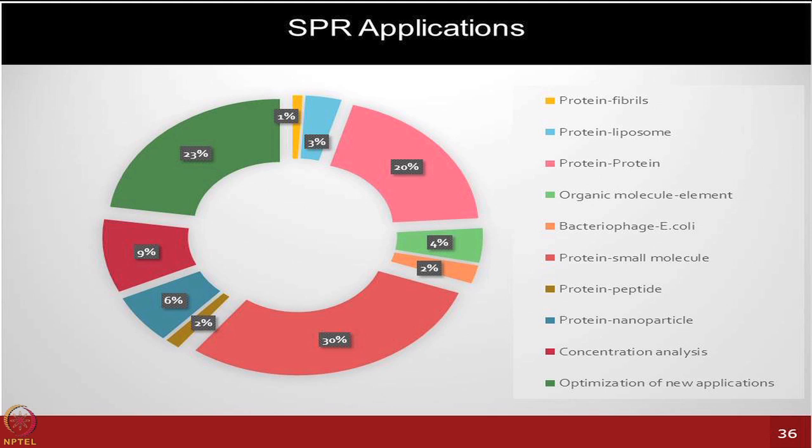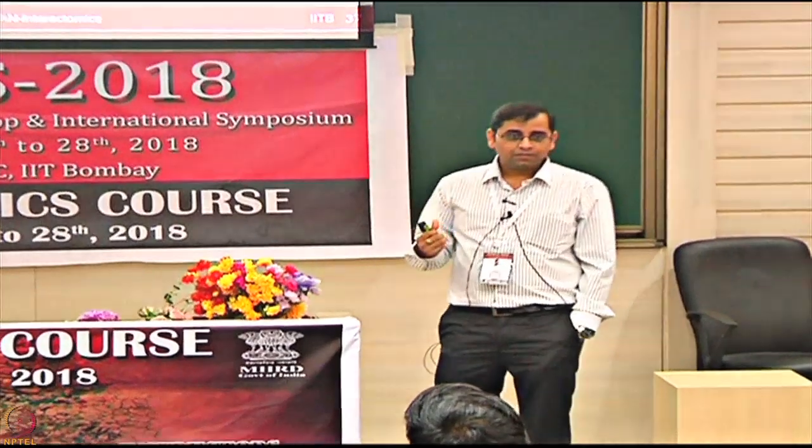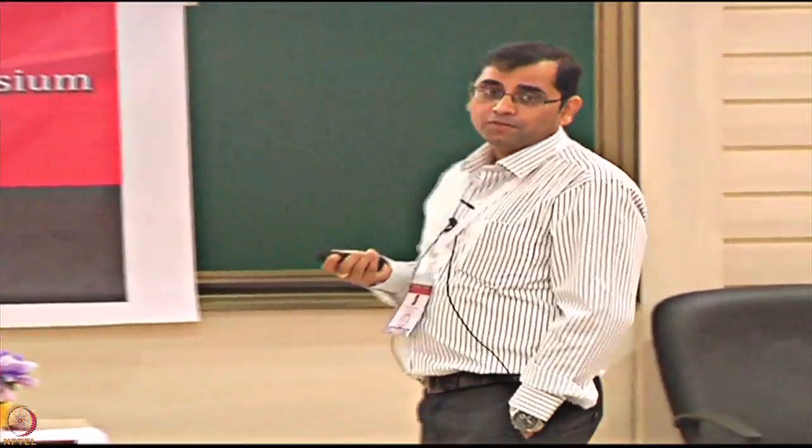We always want to see what more we can obtain from these instrument platforms. So I'm now flashing through a couple of application slides, with just the intention of showing what all can be done on these platforms. These are not my results, just results coming from our facility, where our people are running the experiments. But it shows you that a variety of things can be done.